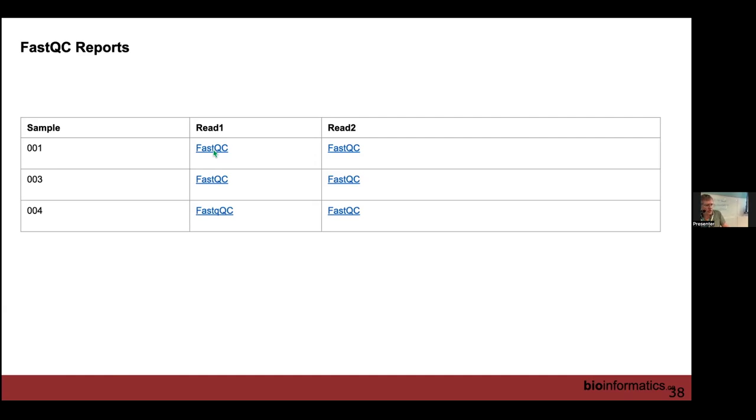The reality though is that with FastQC, we run it on all of our data. We don't have somebody looking at each of these reports trying to figure things out. We have things automated through our pipelines. They will pull in this data and raise flags if we see issues. Often, if we get something coming out of the data that doesn't look right, that's kind of funny, and we're not sure what's going on, these are things that are generated that we can go back to and take a look at and see if something in there tells us why we may be seeing something that we're not expecting.